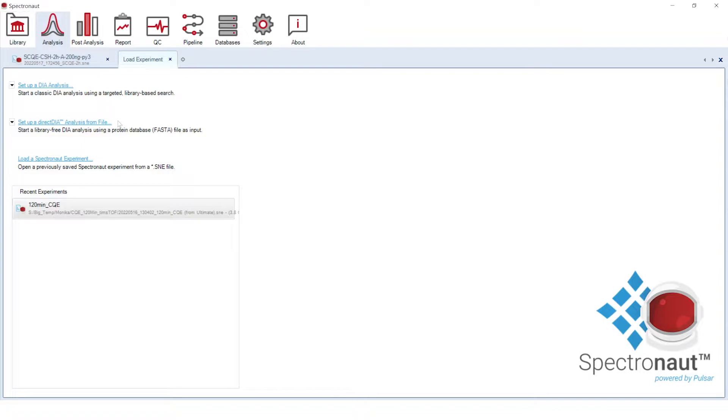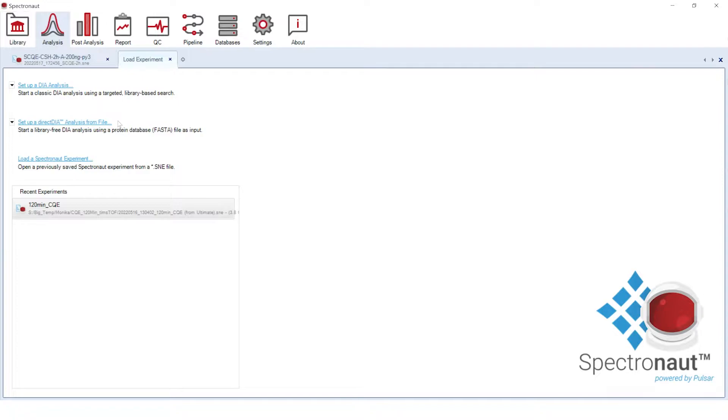In the analysis perspective we will start with selecting Direct DIA analysis. Biognosys spectrum-centric DIA analysis workflow that uses a FASTA protein database as an input. Direct DIA doesn't require a prior generation of the spectral library since the project-specific spectral library will be generated directly from DIA runs in the first step of the workflow.